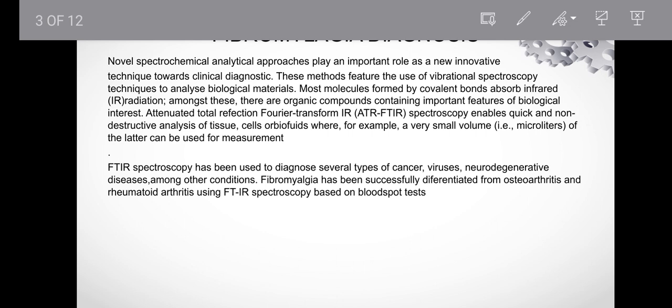So how is the sample collected? It is very interesting to note that in the case of biological fluid, especially fluid from the human body, the part which needs the most care is the sample collection. In this case study, 126 patients affected by the disease and 126 unaffected people underwent the study. The sample collection was from July 2018 to March 2019, done at the Federal University of Rio Grande do Norte in Natal, Brazil. Socio-demographic data. You may think, why is the socio-demographic data here?